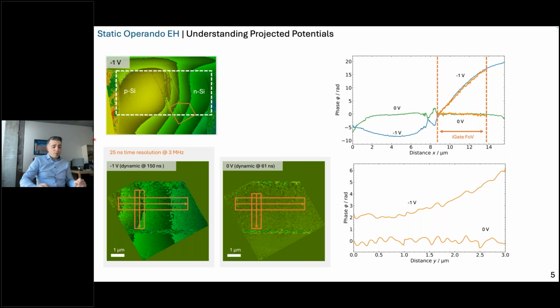So having now the opportunity to look at all these frames, we can basically do a very, very intuitive analysis of the switching behavior by watching a little movie. And this was, once again, the goal of my research: to come up with a tool, time-resolved electron holography, which makes it possible to do real-time investigations of charge carrier dynamics in semiconductor structures.